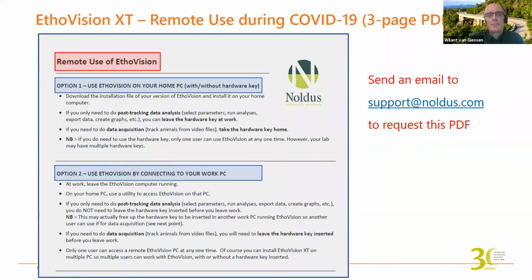We're using version 14. We don't think we can delete trials. You should be able to in the trial list. So just give Wieland a call, and he'll fix you right up. Yeah, talk to me. Come on.